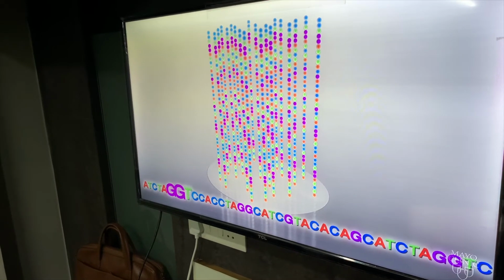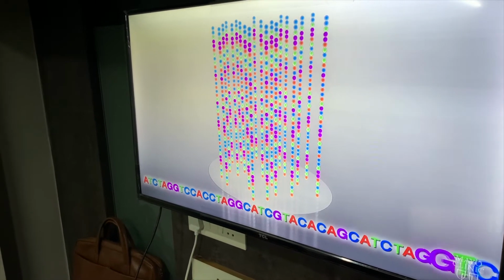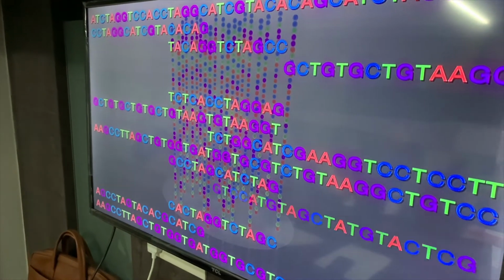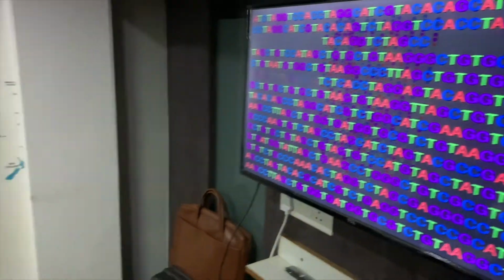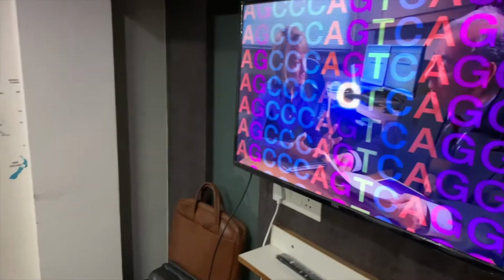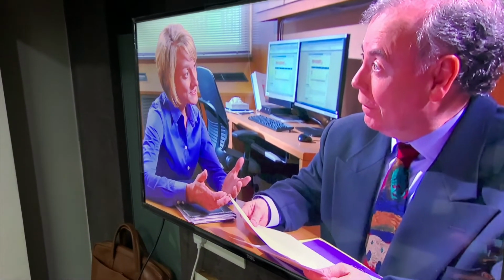This sequence of colors reveals the DNA sequence of each fragment. Powerful computers piece together these individual DNA fragments and reveal the sequence of your DNA. Then a team of medical experts uses specialized software to analyze and compare the DNA sequences to identify the handful of variants that may be important for your medical care. Discuss the results of the sequencing of your DNA with your doctor and a genetic counselor.